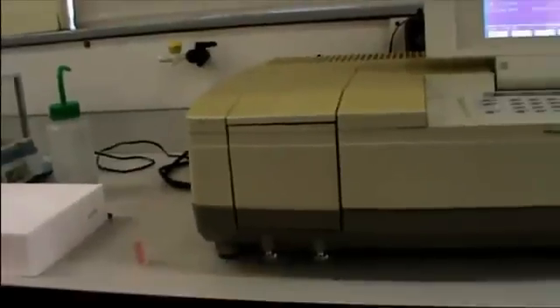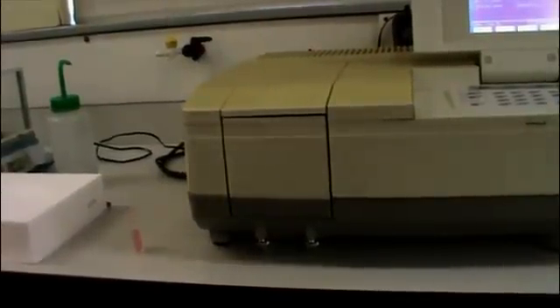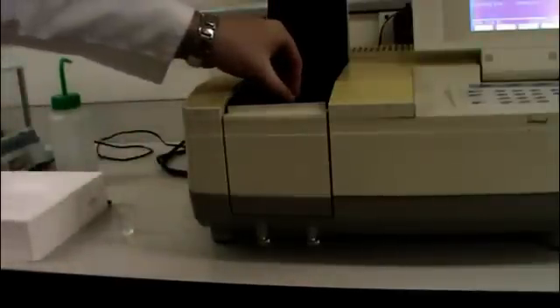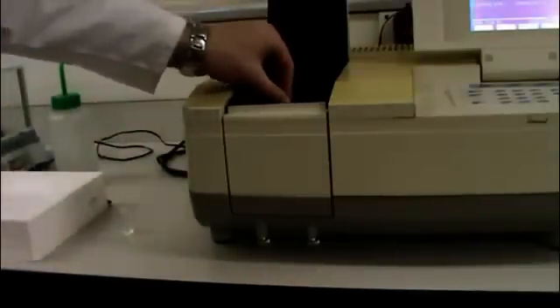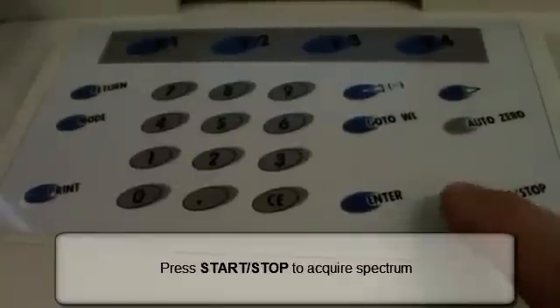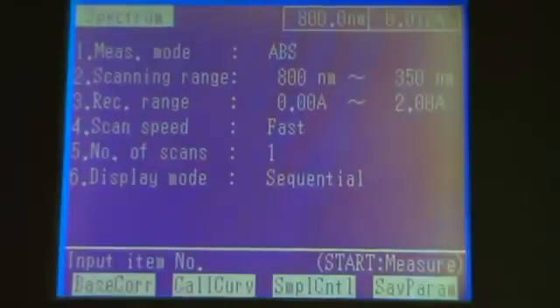So here is our sample. When the zero is complete remove the solvent cell and place your sample in the sample holder. This is always at the front of the instrument. Close the lid and press start stop to acquire your spectrum.